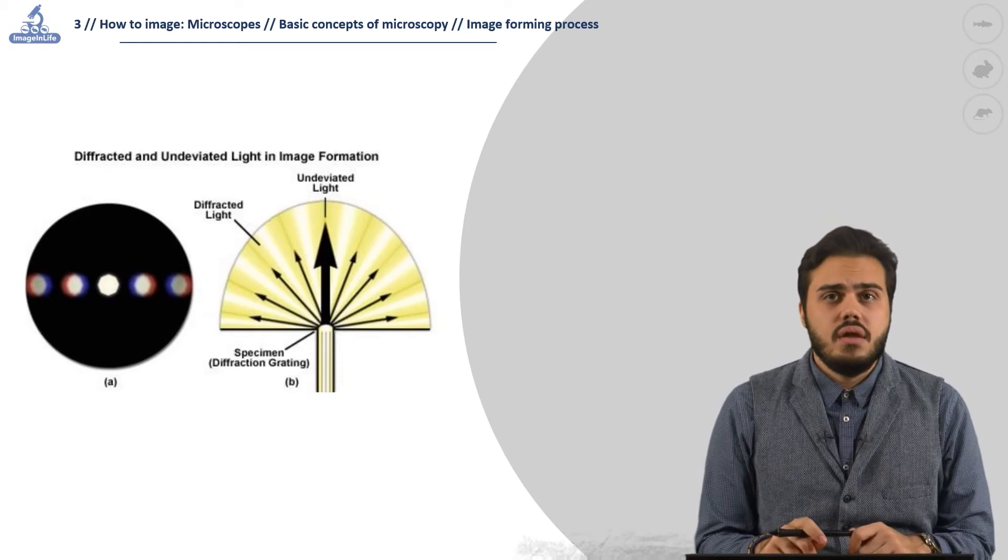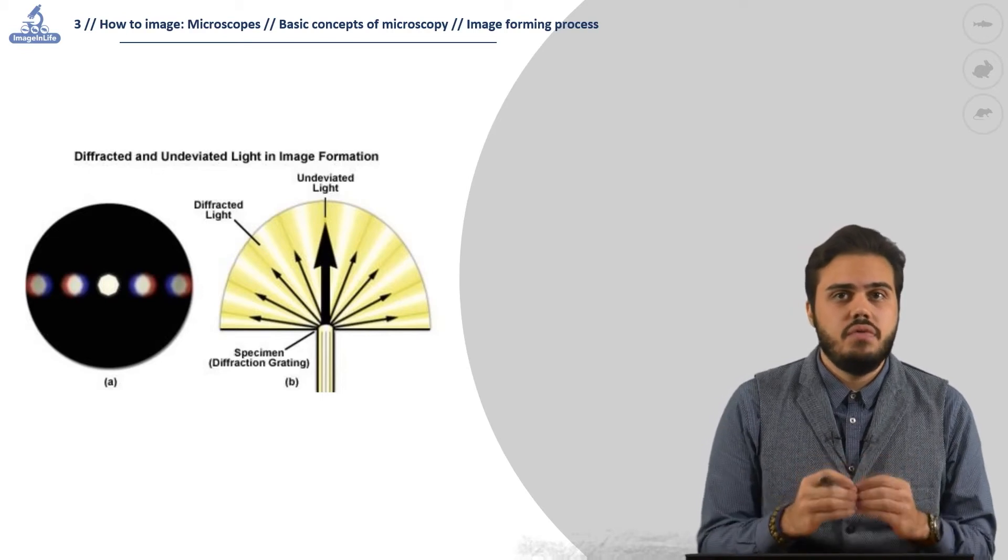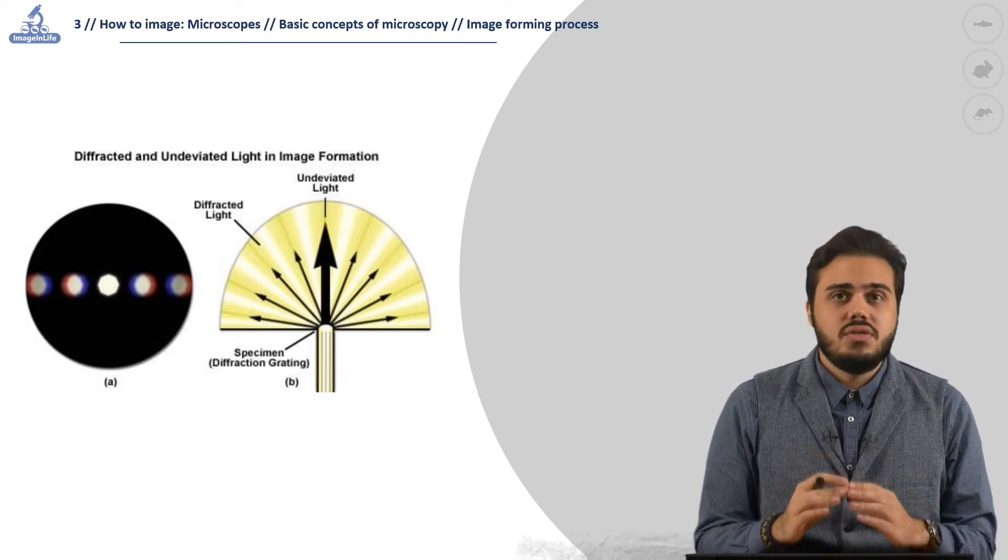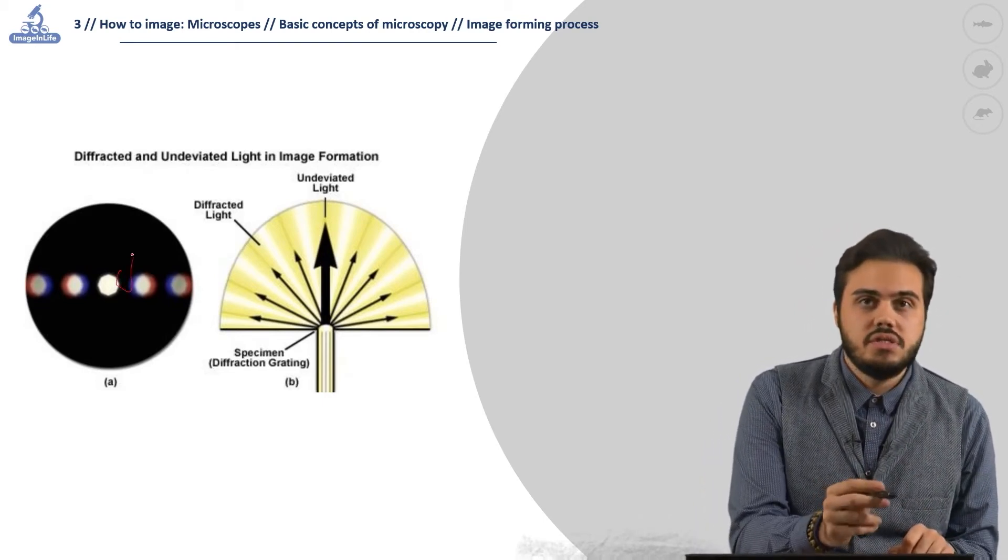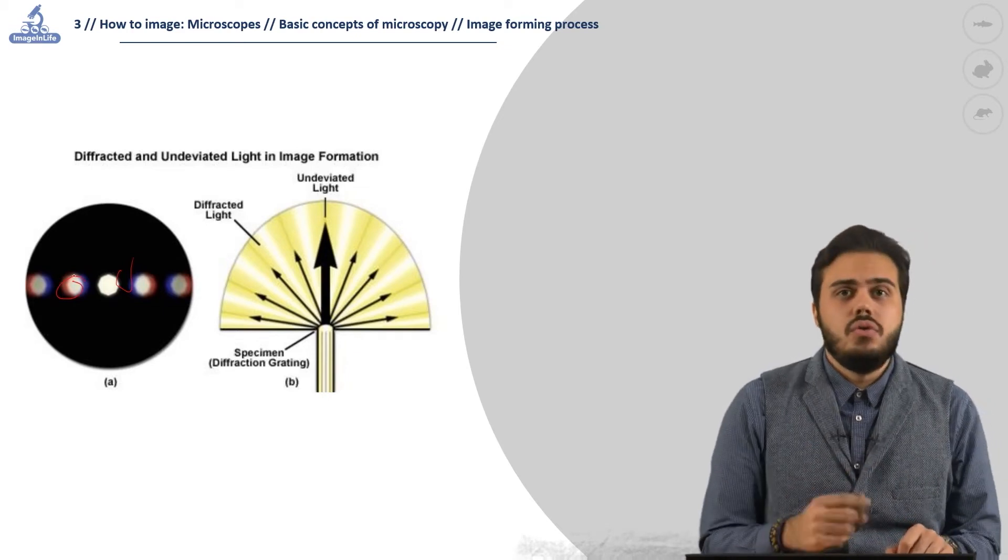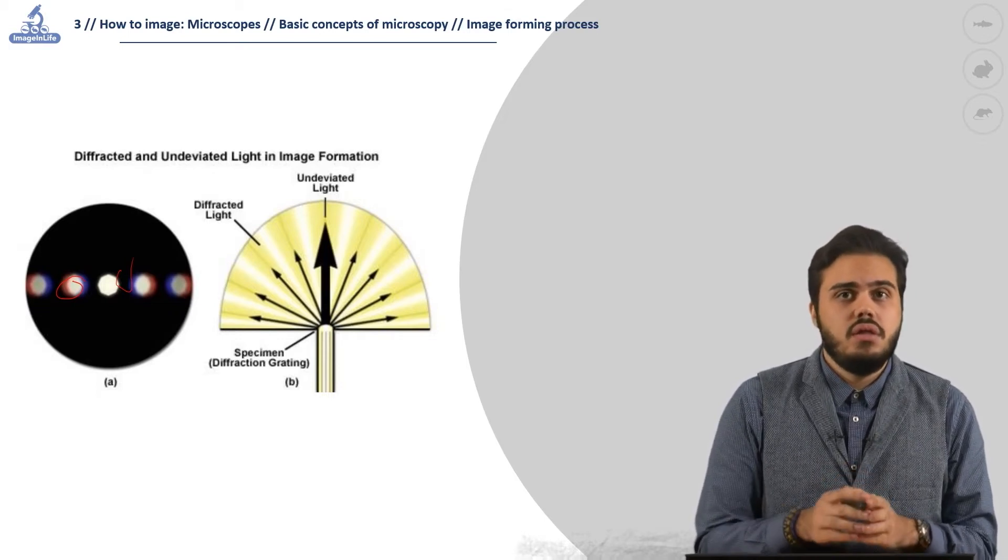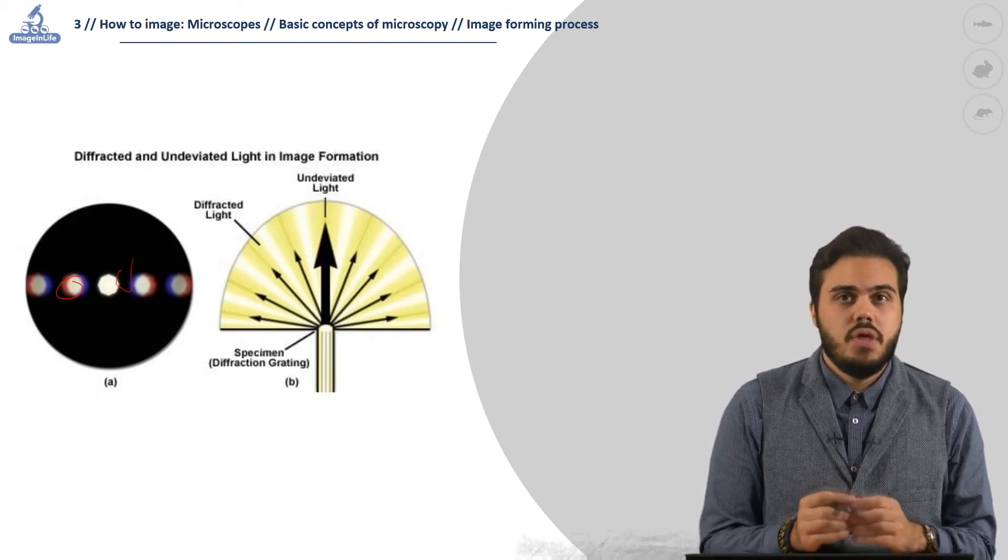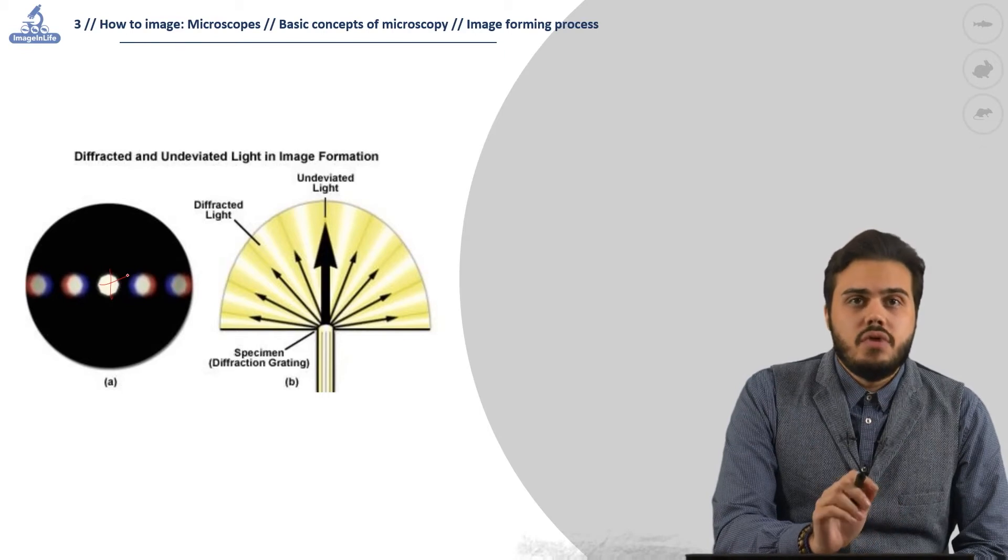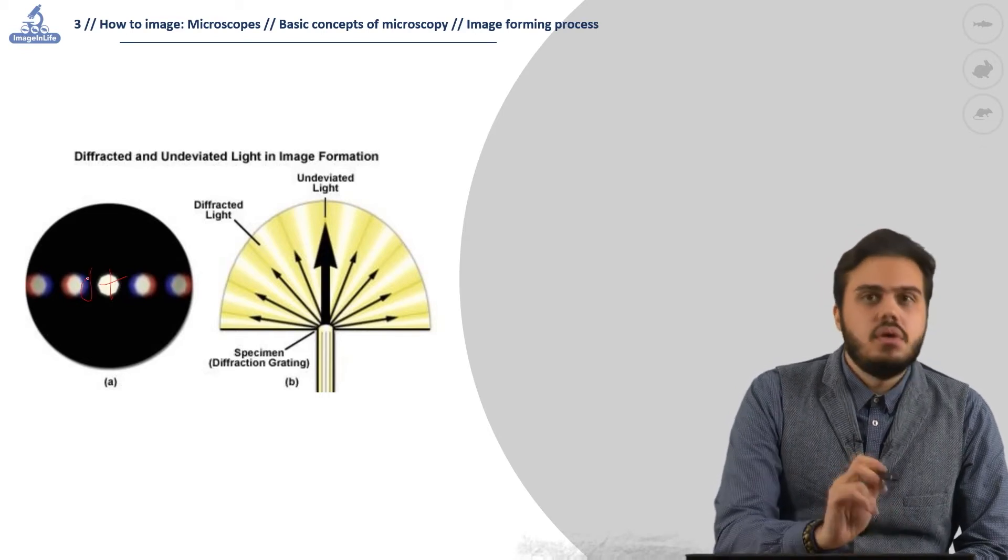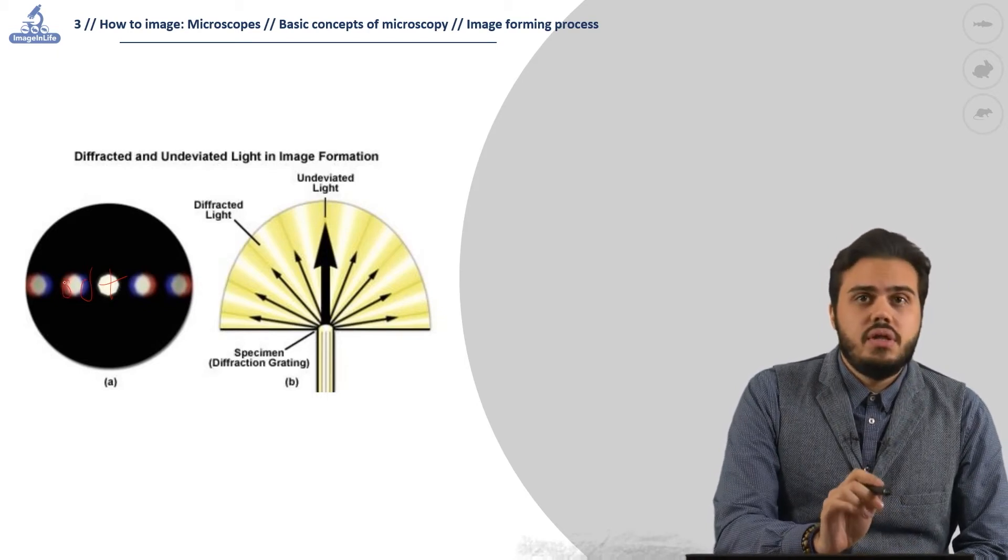The diffracted light interacts with the direct light in the rear focal plane of the objective, creating constructive and destructive interference. The destructive interference generates dark areas, while the constructive interference forms light spots. Due to different diffraction properties of different wavelengths, we will always have spots of light in different orientations or shapes. In the center, we will always have a bright spot made from the undiffracted light. We will have spots that have blue areas towards the central spot and red areas on the other side, with green areas in the center.